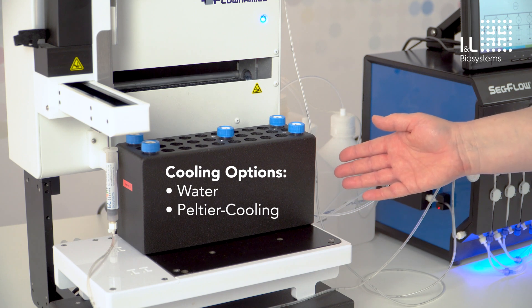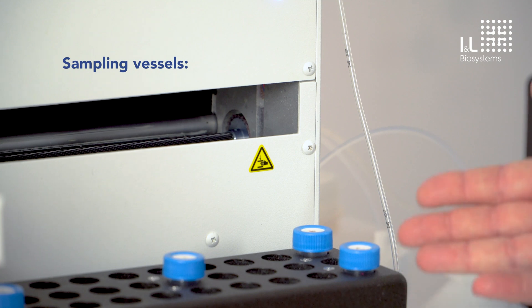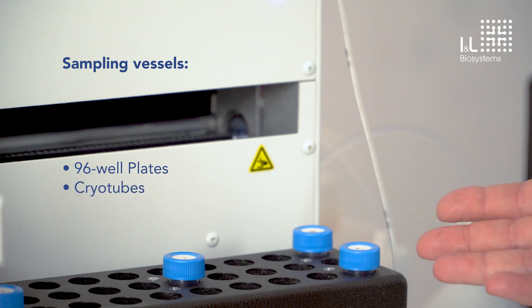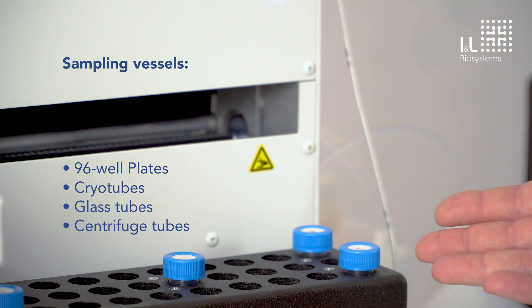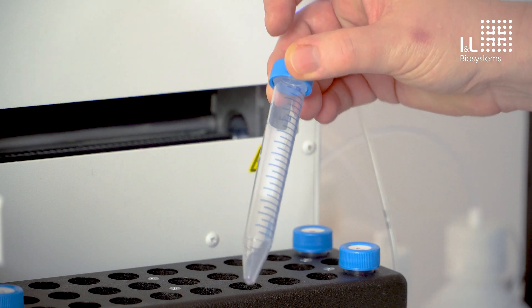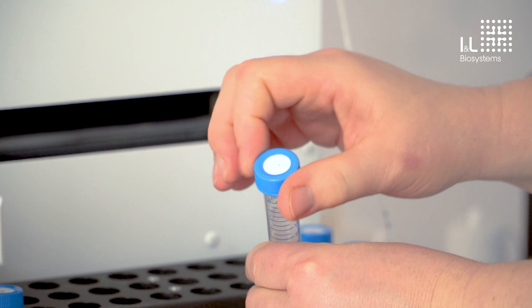This version uses water cooling. Alternatively, there is a version with Peltier cooling. As sampling vials for the Flow Fraction, you can use, for example, 96 well plates, cryotubes, glass tubes, or centrifuge tubes up to 50 ml. Here we have the 15 ml version, as you can see, with a lid and a septum that seals the vial.